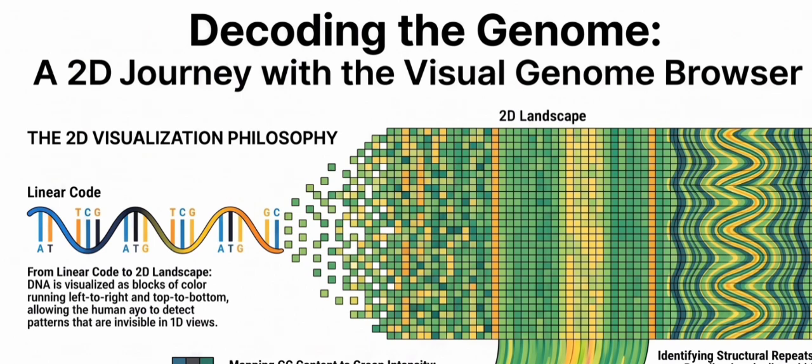Okay, the simplest wildcard is a period or a dot. If you are searching for a binding motif, but you know that the exact base at the third position doesn't actually matter for the protein to bind, you simply insert a dot at that position in your search string. So I just type AC.G. Right. You are telling the search engine, I need an A here, a C here, but at position 3, I will accept absolutely any nucleotide, A, T, C, or G. Just make sure the rest of the sequence matches. That offers flexibility, but it's quite broad.